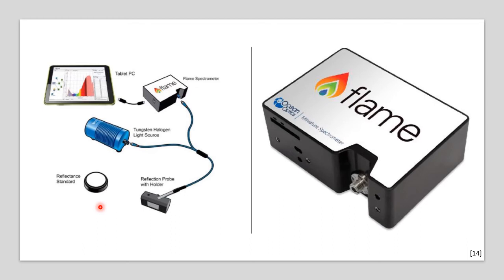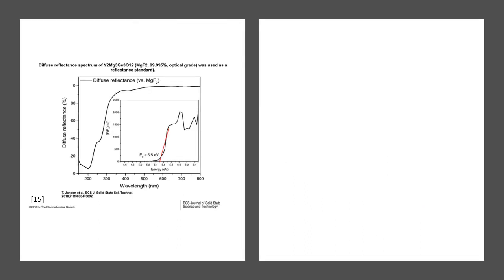Here is an example of what I mean. So we can see that for this specific reflectance standard, the reflectance spectra for the visible range sits around the same level, which is what we want. The data that we can then collect from our sample can be measured as a percentage of the intensity of the spectra from the reflectance standard for each wavelength.